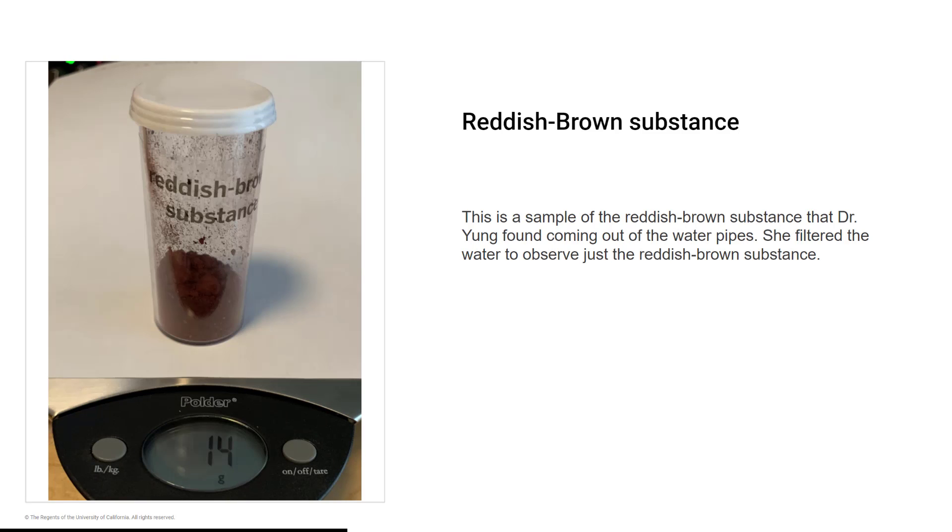Reddish-brown substance. This is a sample of the reddish-brown substance that Dr. Jung found coming out of the water pipes. She filtered the water to observe just the reddish-brown substance.